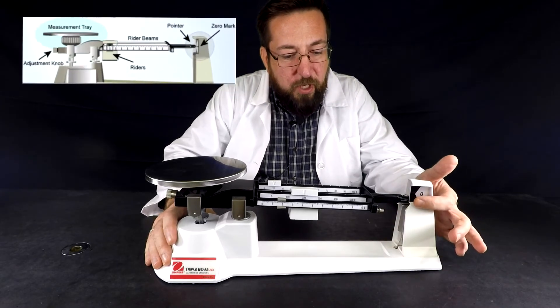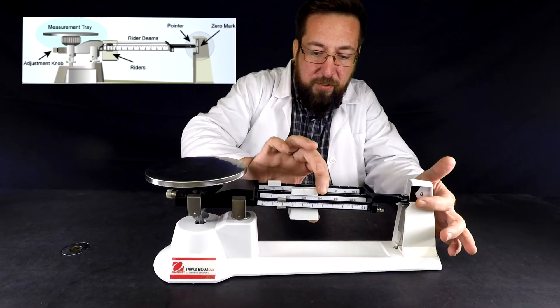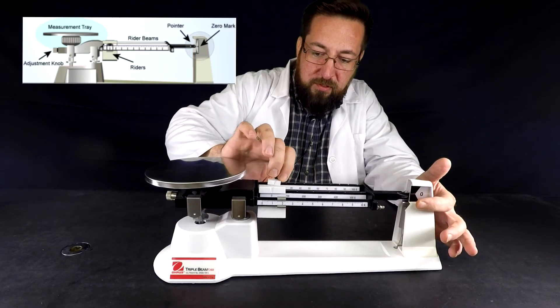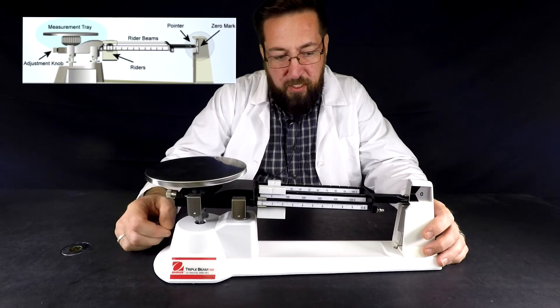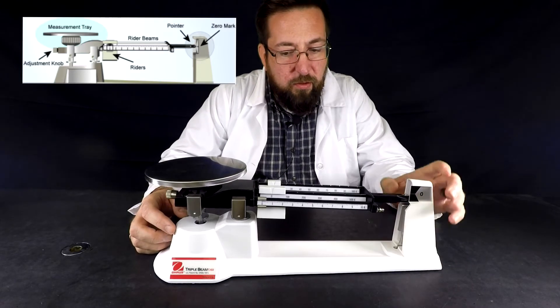First I've got the zero mark over here, the riders, the pan, the adjustment knob, and the rider bars.